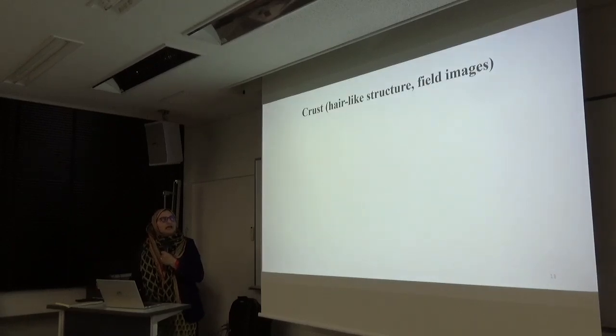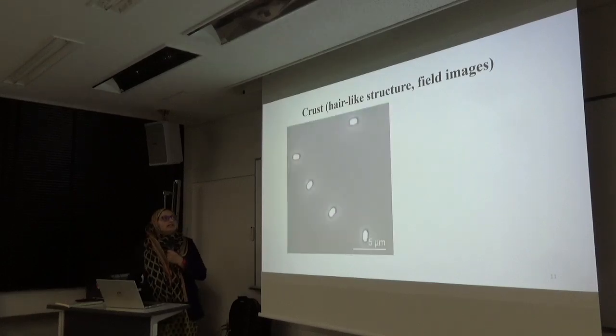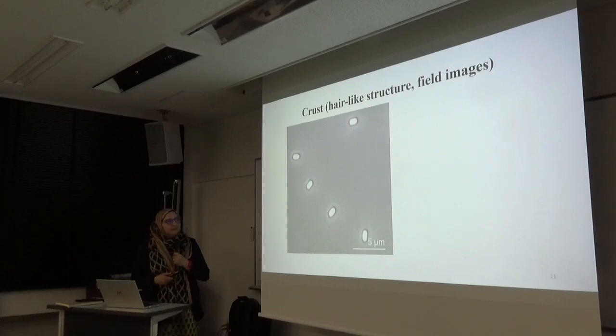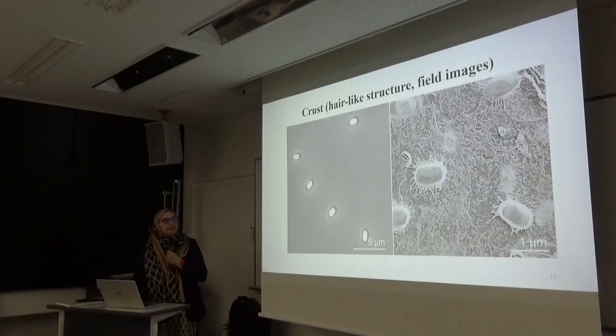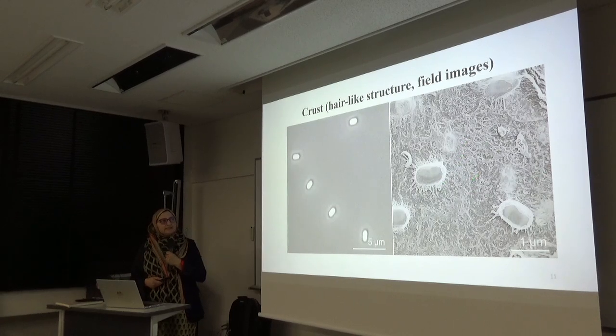First, I observed the endospore structure, and this is how the spore looks in the optical microscope. First I confirm my condition, and then next I quickly freeze the spores by quick-freeze deep-etch electron microscopy, and this is the same. These are the spores under quick freeze.